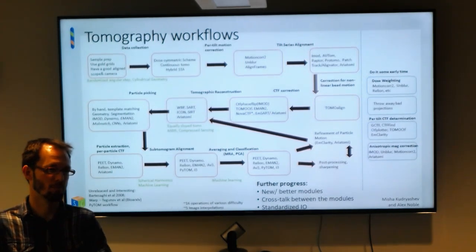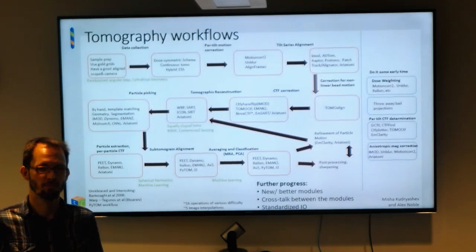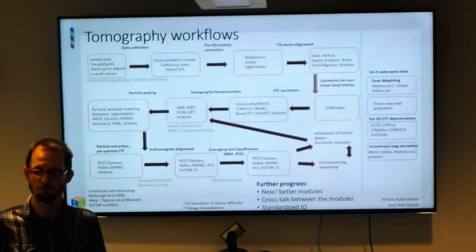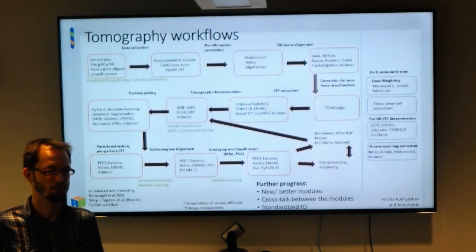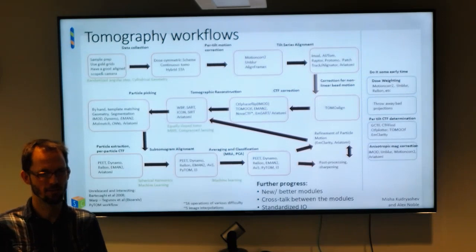So I'll send out a worksheet for you guys, and you can install, and there will be problems installing the software. Come along Wednesday, and then we'll play around with tomography and IMOD and some of the nice tomograms and Leginon for single particles. So this will actually be hands-on. Download some software. It's pretty easy. IMOD installs into most things pretty simply.